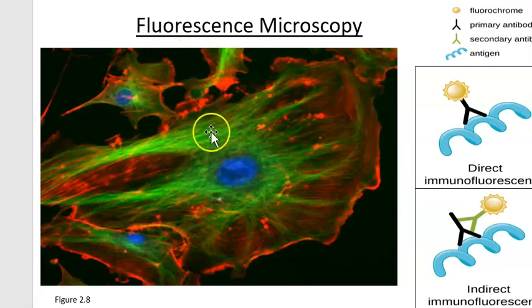The other really nice thing about this is not only can you get this specific part of it, but also notice the background. It's totally black, and we're only seeing these colors where the specimen is being painted with a fluorescent molecule. So you get very, very good high contrast against a dark background there when you're looking at these fluorescently labeled structures.